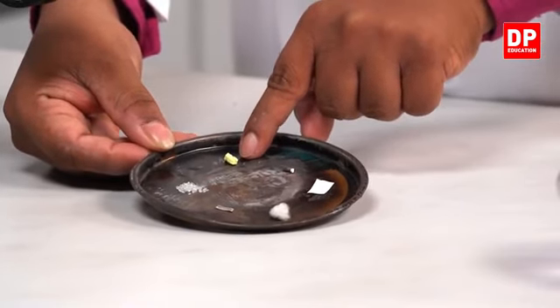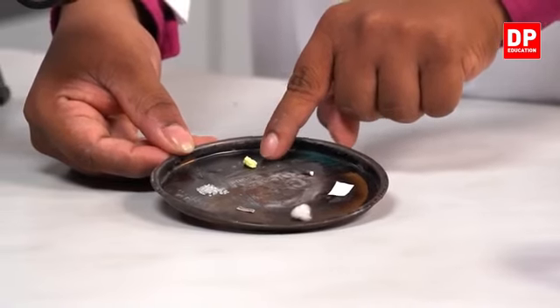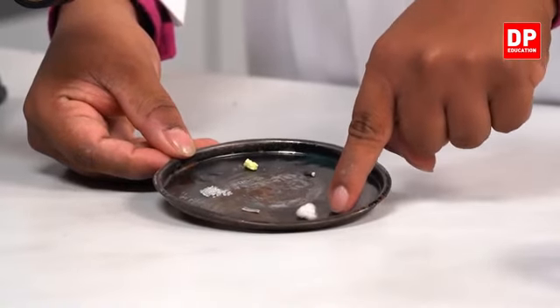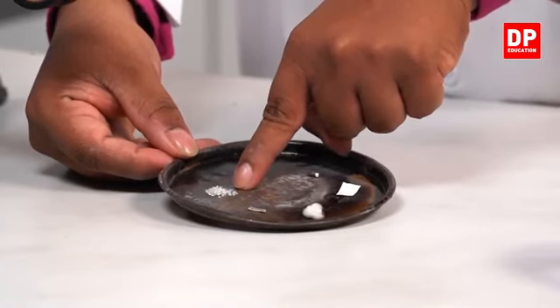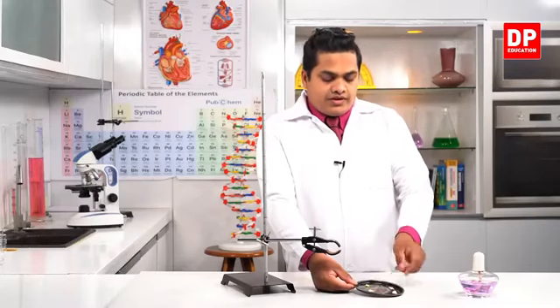This yellow colored substance is a piece of sulfur. So: sulfur, matchstick head, piece of paper, cotton wool, piece of magnesium, and some sugar crystals.